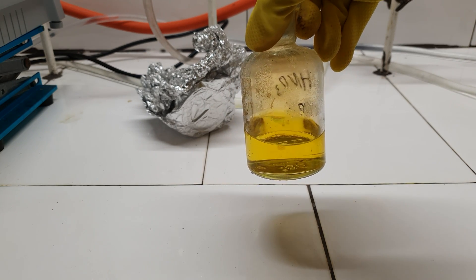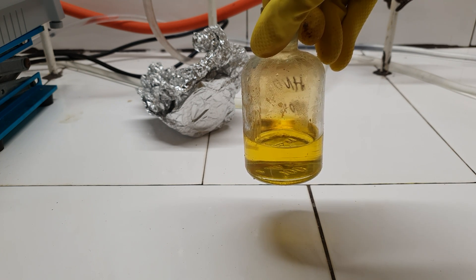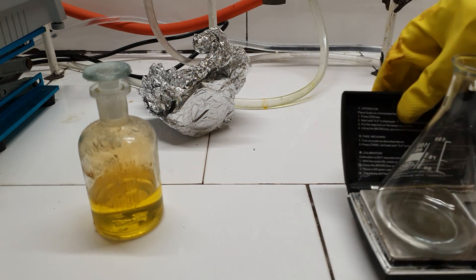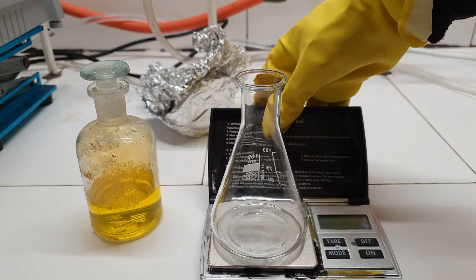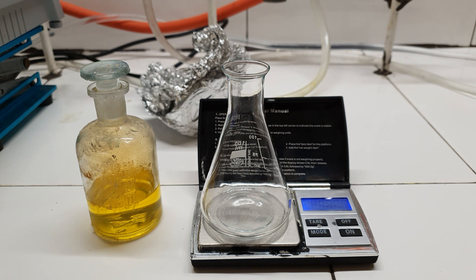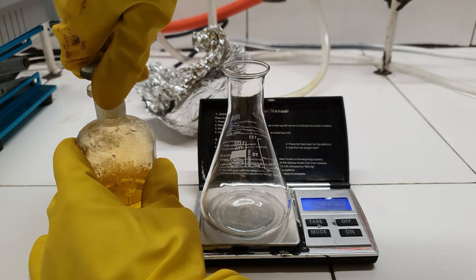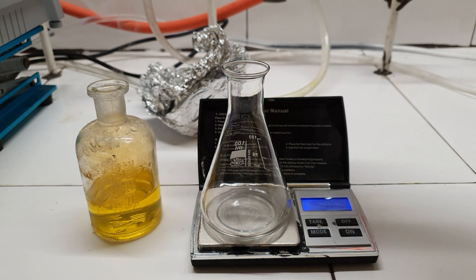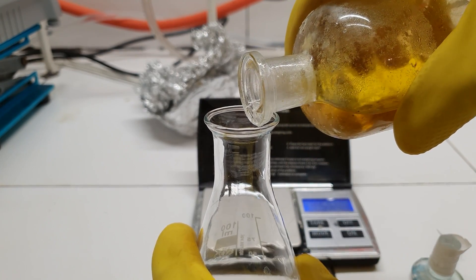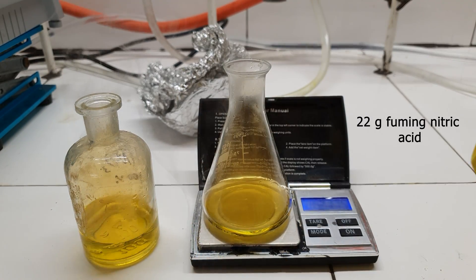Meet fuming nitric acid. Unlike the normal concentrated stuff, which is only 68% with the rest being water, fuming nitric acid is basically 100% pure nitric acid. Mine has a slight yellow color because it is not very stable and decomposes in light, liberating some nitrogen dioxide which colors it. And guess why it's called fuming? Because it fumes. And I'm serious — if this spills on your gloves, it will set them on fire. I measured out 22 grams of the acid.